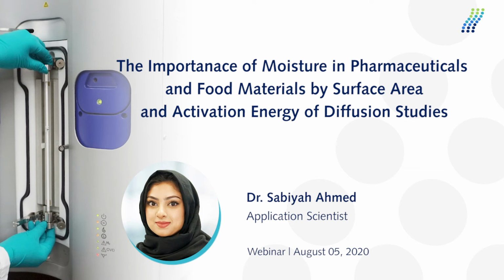So the topic today is the importance of moisture in pharmaceuticals and food materials, analyzing surface area and activation energy of diffusion studies. So in the presentation today, I'm going to go over an introduction of two techniques, iGC-SEA and DVS. And then I will go on to talk about the experimental methods we carried out, and some results.